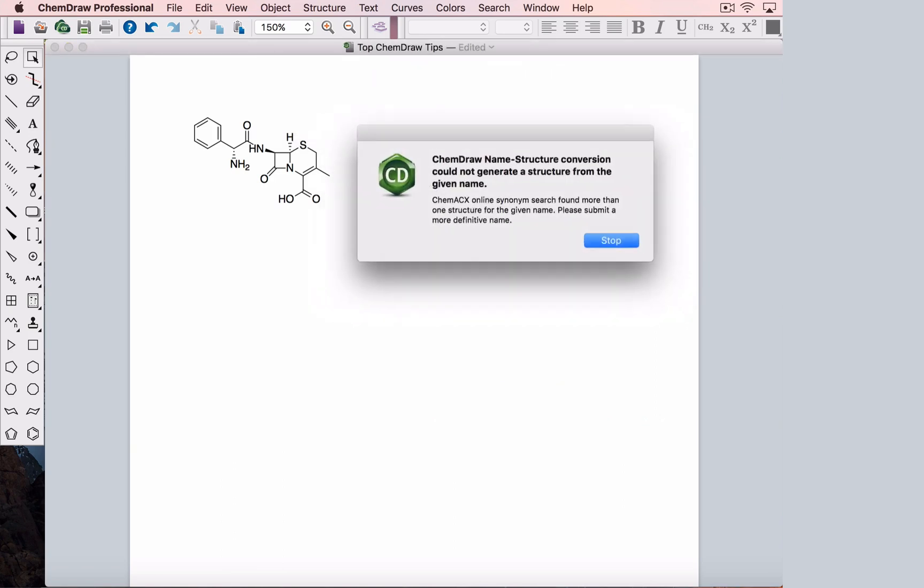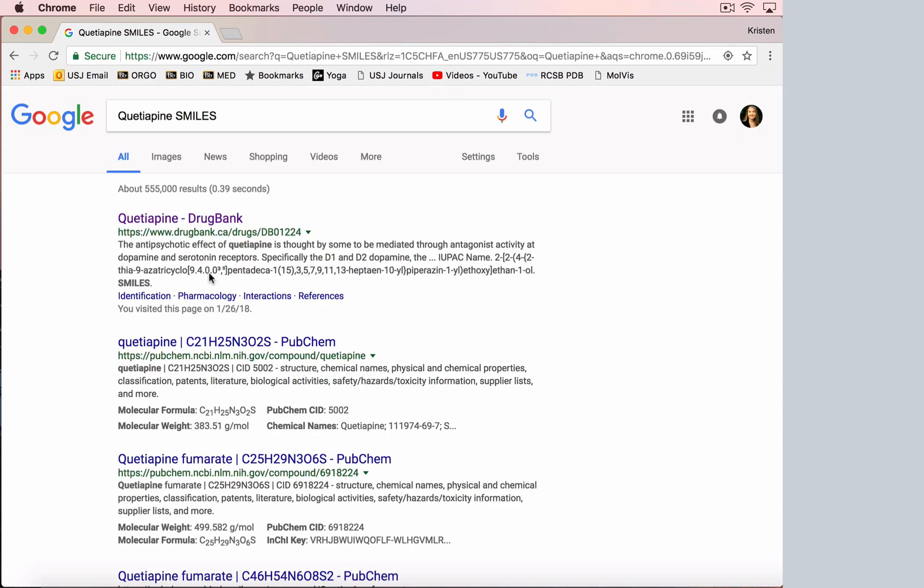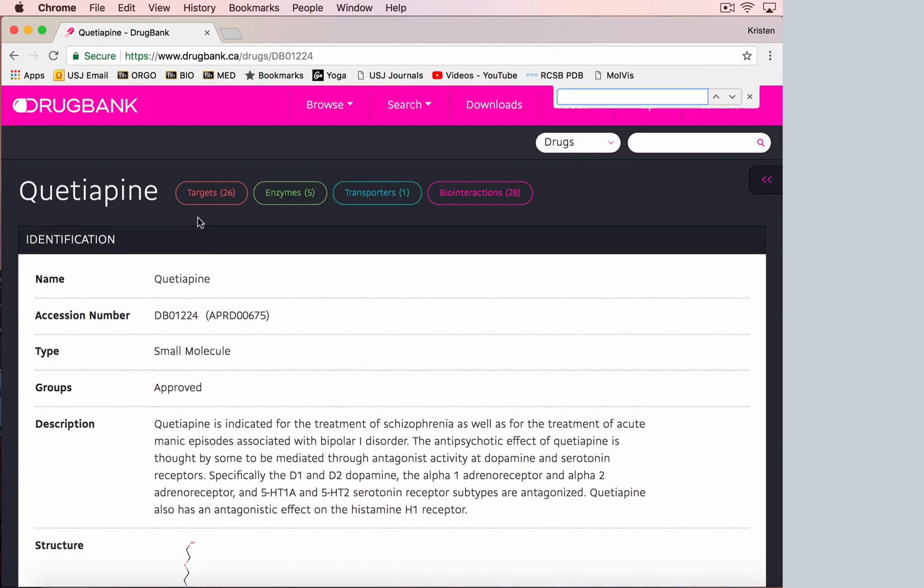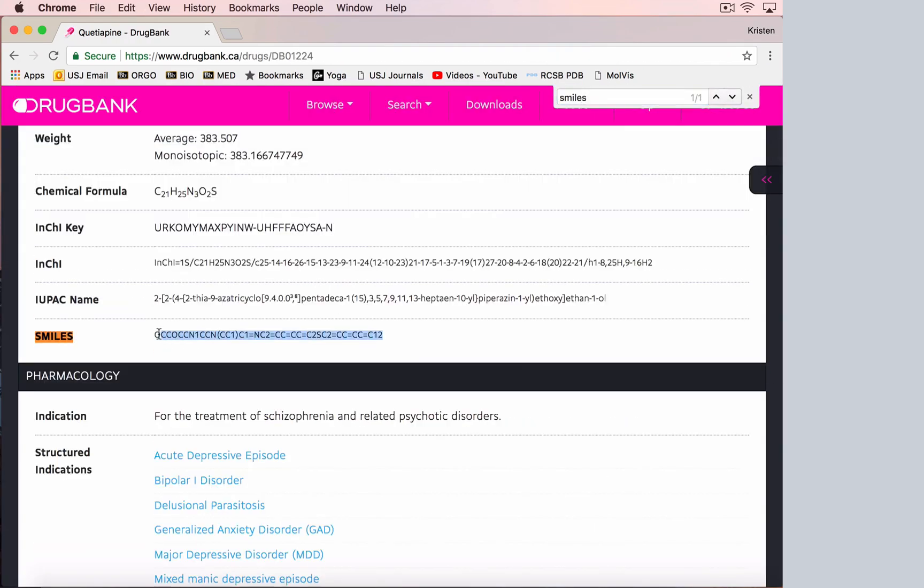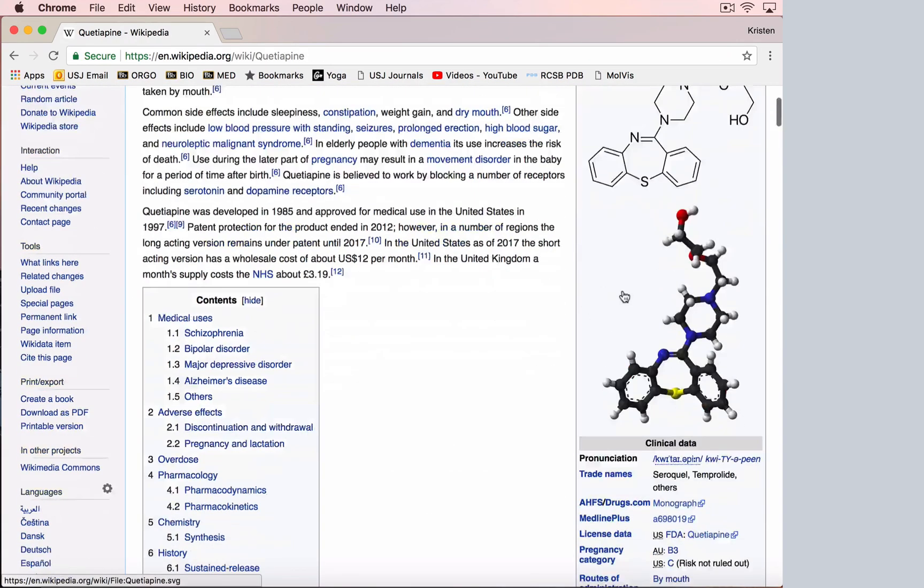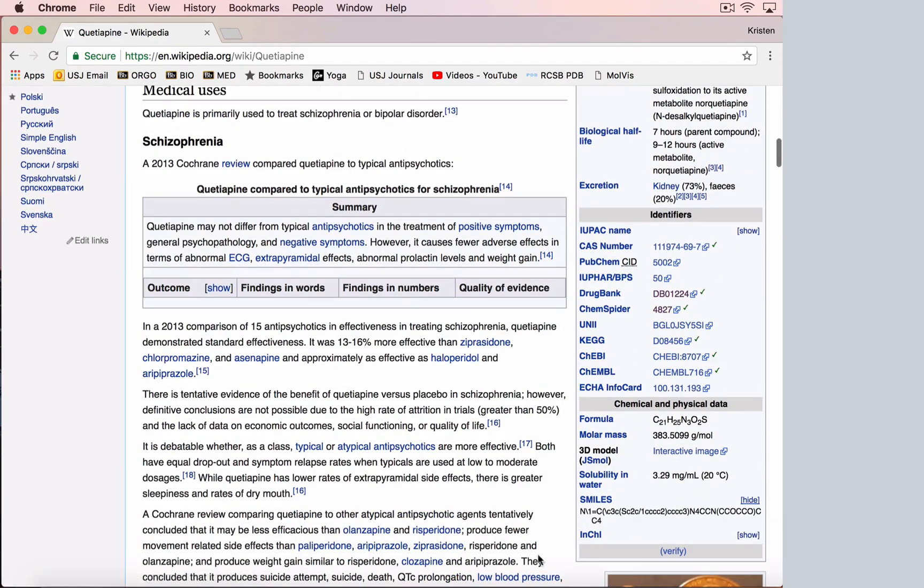Sometimes ChemDraw can't figure out your structure from the name. In this case, you can go online and find a chemical identifier to use. I usually use a SMILES string. Google the compound name with the word SMILES and then you'll be able to use ChemSpider or DrugBank to copy the SMILES string. Wikipedia has SMILES strings also, you just need to click show.